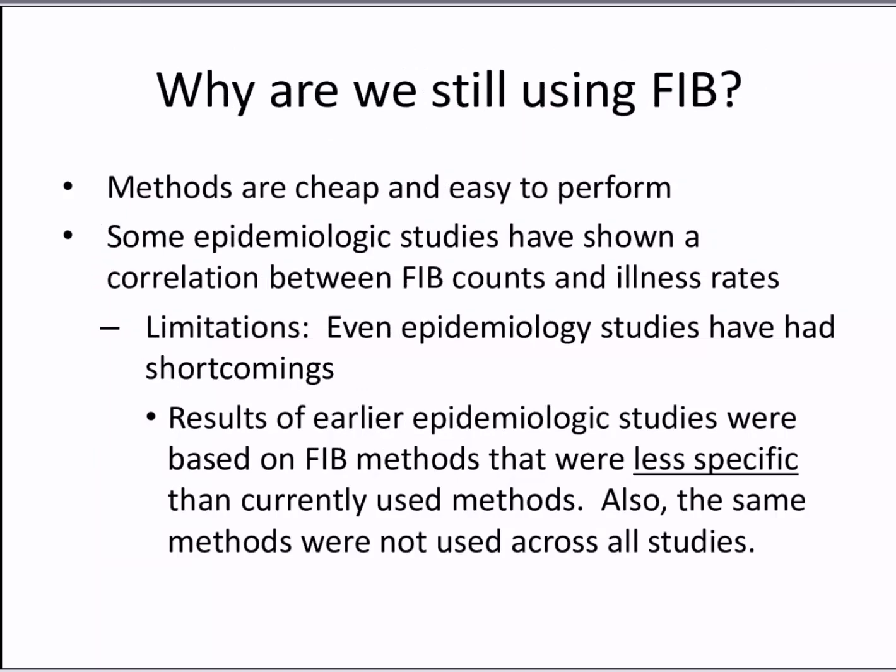So why are we still using fecal indicator bacteria? Well, the reason is because the methods are cheap and easy to perform, and there's been some epidemiologic studies that have shown a correlation between FIB counts and illness rates. But caution, even epidemiological studies have shortcomings.